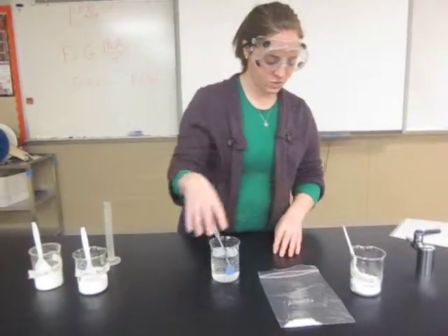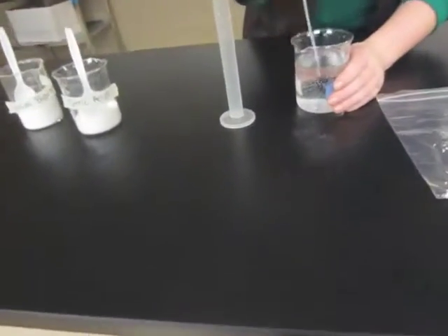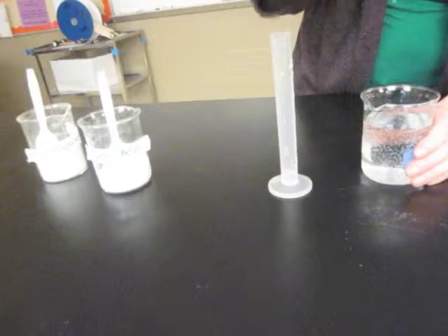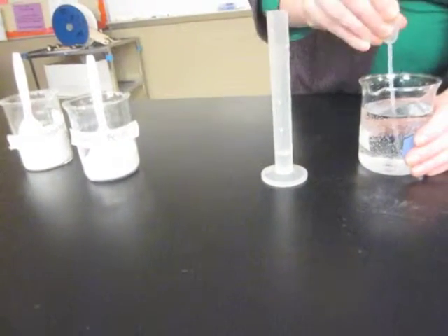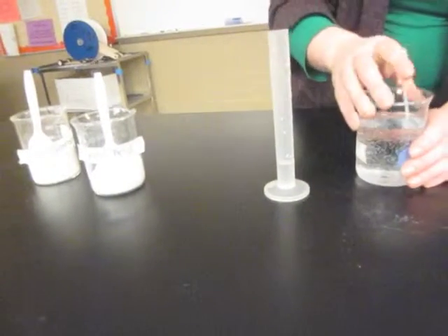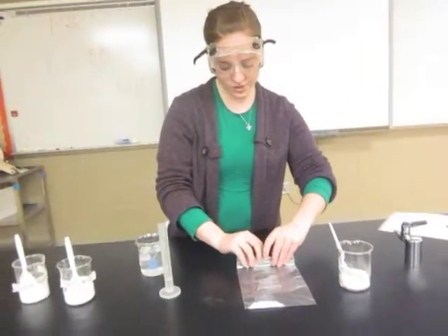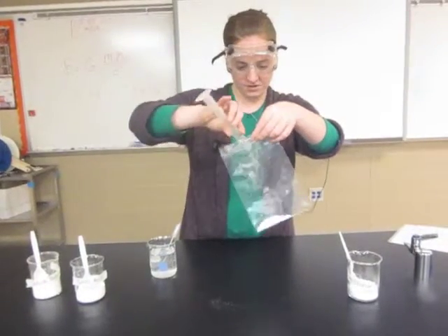After you put one scoop of calcium chloride into the plastic bag, you want to measure out 5 milliliters of water using your pipette and your graduated cylinder. And remember, you want to be as close as possible to the 5 milliliters. If you're a little over, a little under, it's not a big deal. You're going to pour your water into the plastic baggie and then quickly seal it just like we did before.